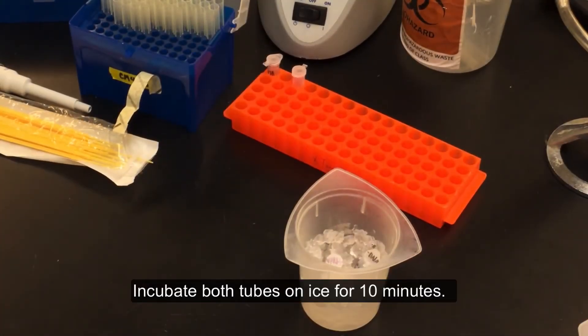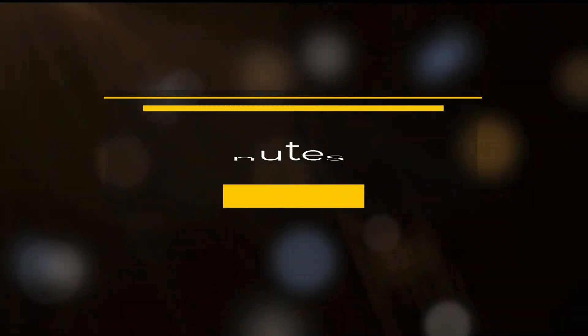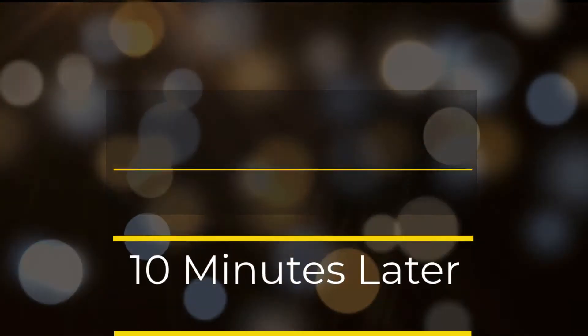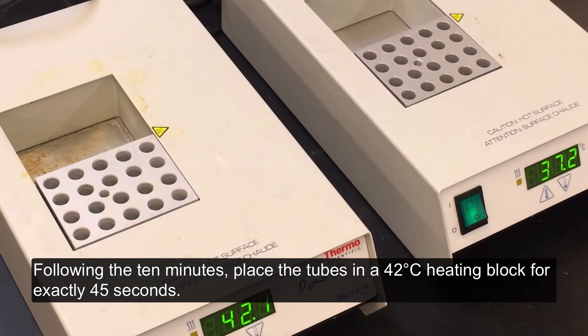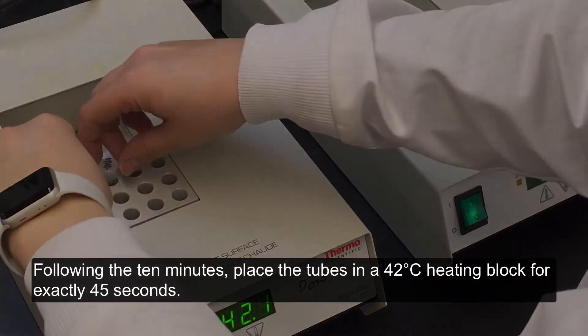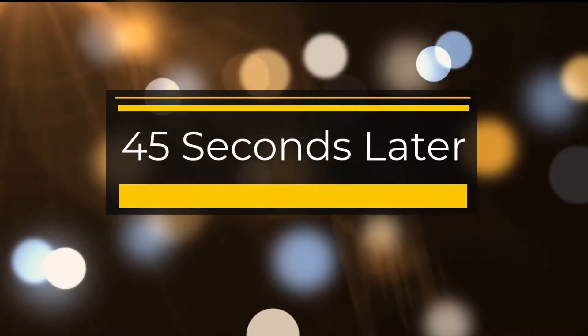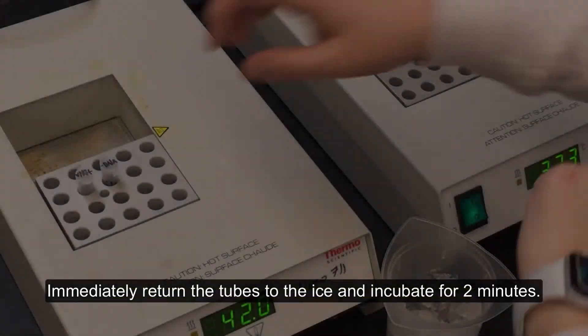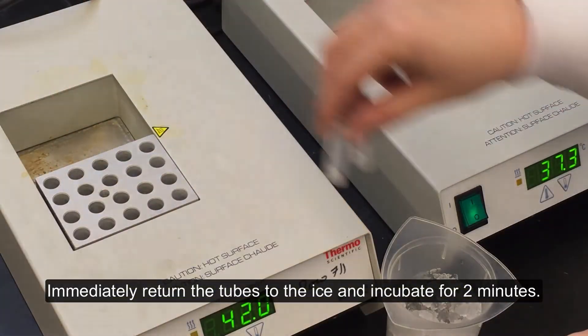Incubate both tubes on ice for 10 minutes. Following the 10 minutes, place the tubes in a 42 degrees Celsius heating block for exactly 45 seconds. Immediately return the tubes to the ice and incubate for 2 minutes.